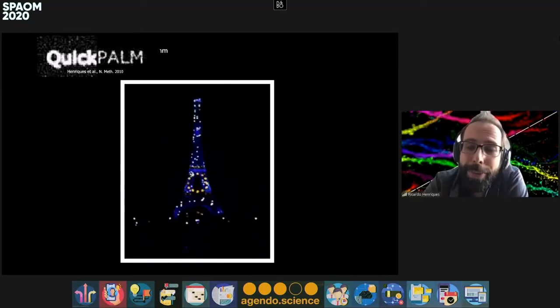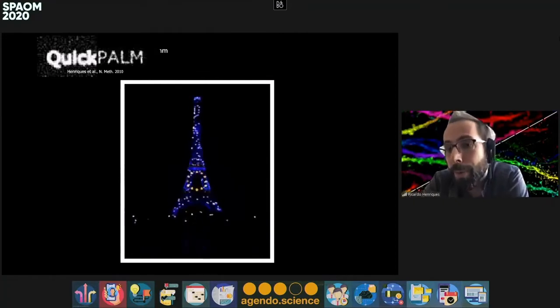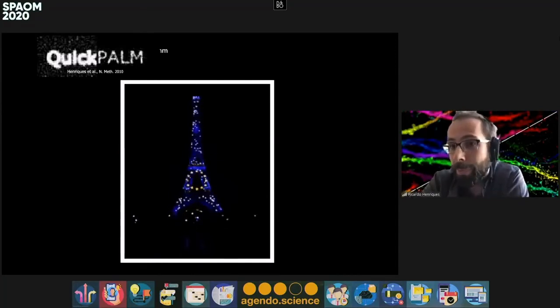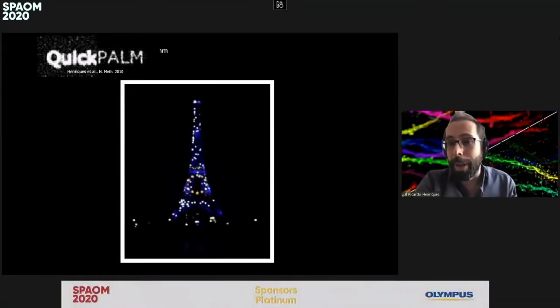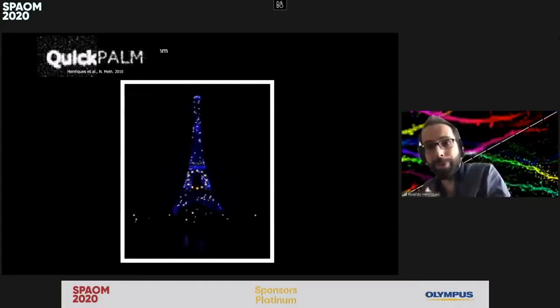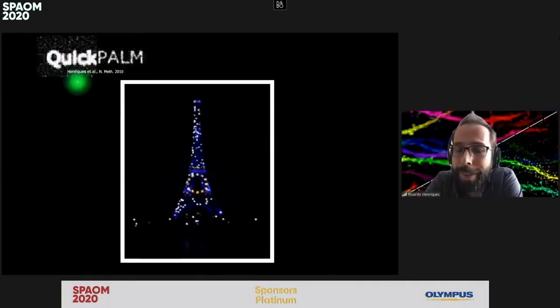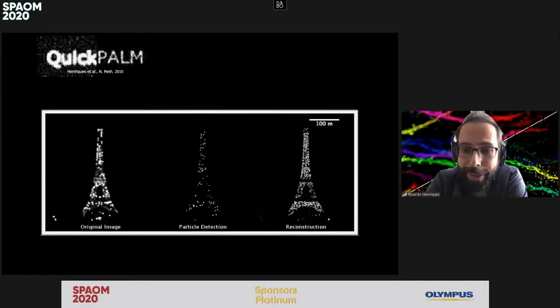However, this is really beautiful because it tells you how physics is universal. My mobile phone that is collecting this movie has a lens with a circular aperture, exactly the same way that my microscope has a lens with a circular aperture. So the same physics imposed by the aperture on the microscope is imposed by the aperture on my mobile phone. What I'm filming here is exactly the same thing that I'm trying to film on the microscope. Back then, I was developing an algorithm to do single molecule localization called QuickPALM. We could apply it to the Eiffel Tower because it's exactly the same thing you see in a single molecule localization microscopy experiment. And thus, you could actually super-resolve the Eiffel Tower.